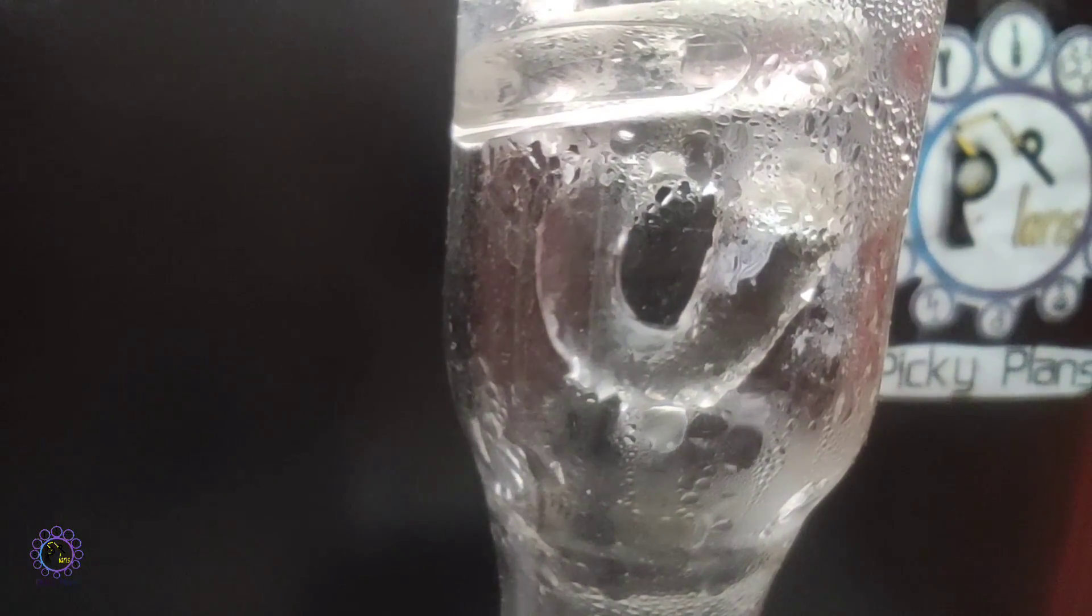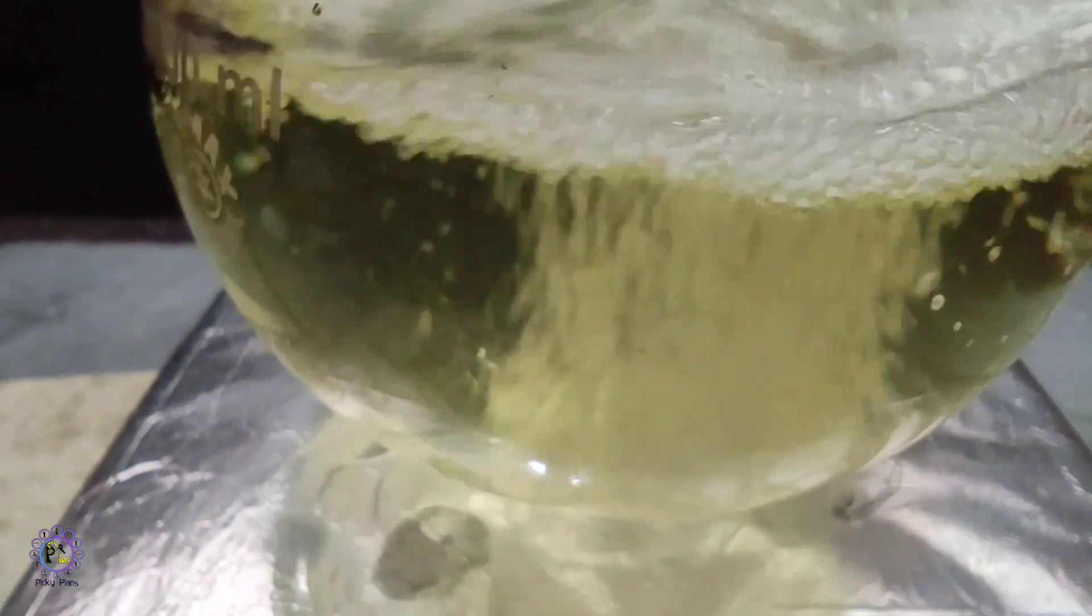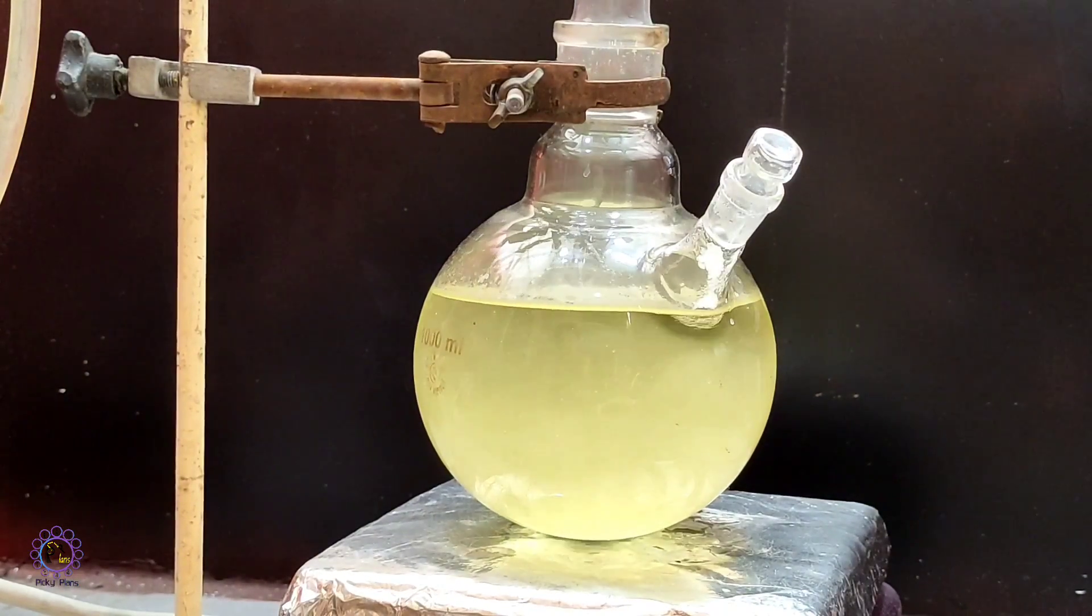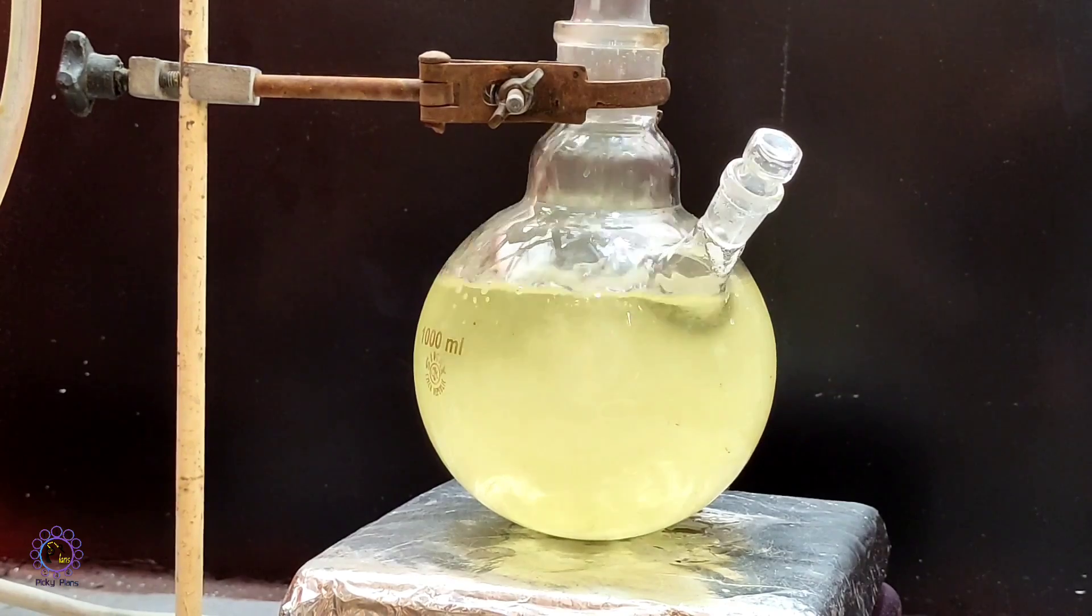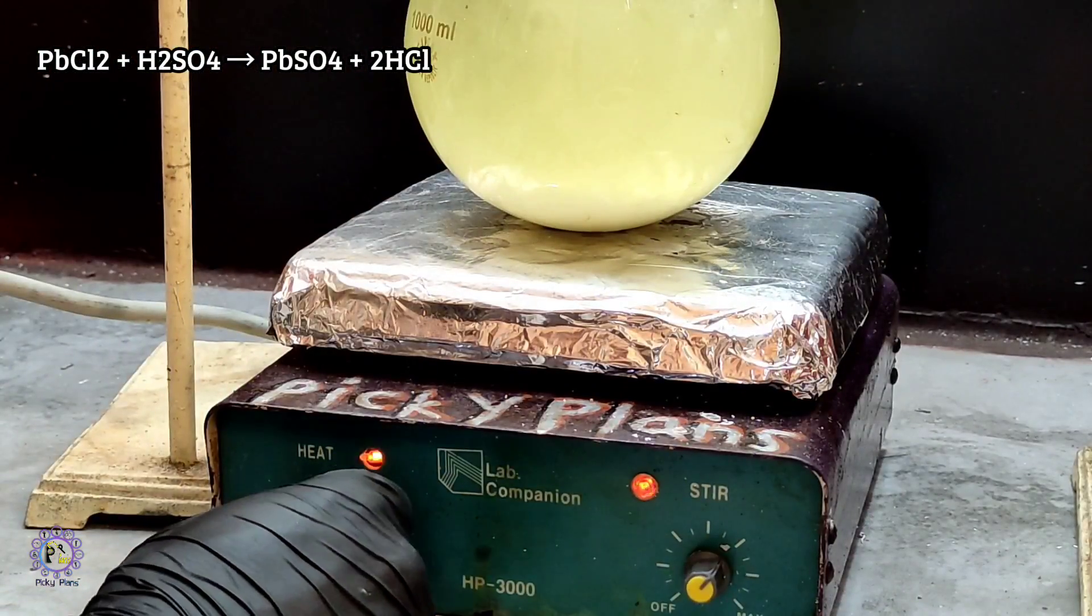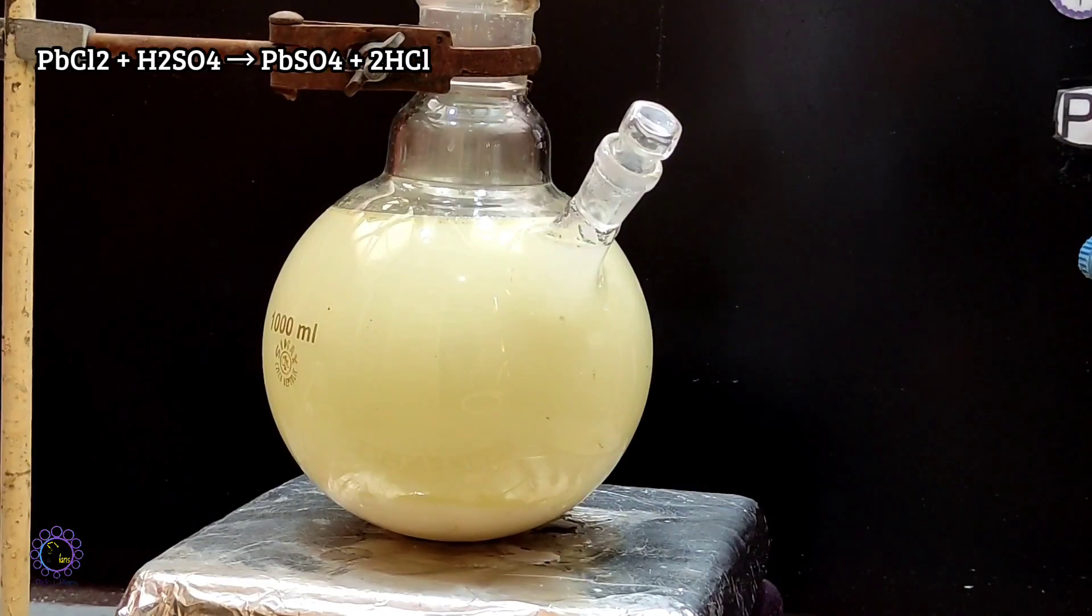That's due to the conversion of all stannous ion to stannic, since we have extra oxidizing agent in the solution which is nitric acid. When the solution of solder wire been completed and solution was still hot, I added some sulfuric acid in order to precipitate lead sulfate.